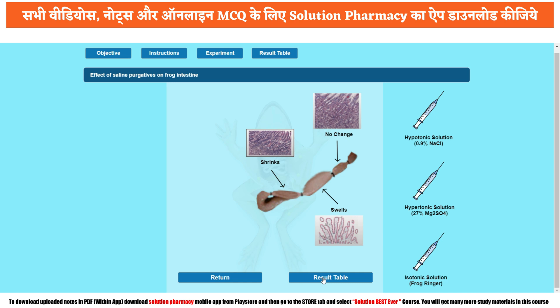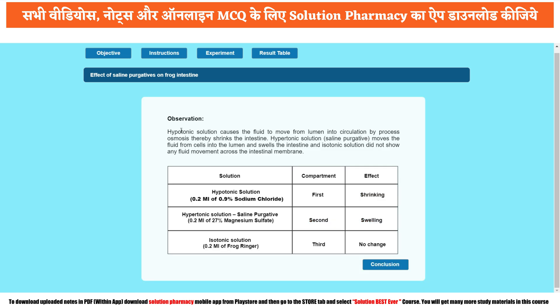The swelling in compartment two proves that saline purgative works on the osmotic principle — it attracts fluid inside and makes the stool soft so it can be easily evacuated. Now go to the result table. Observations: hypotonic solution causes fluid to move from lumen to circulation by osmosis, resulting in shrinkage of intestine. Hypertonic solution (saline purgative) moves fluid from cell into the lumen, causing swelling. Isotonic solution shows no fluid movement across the intestinal membrane.